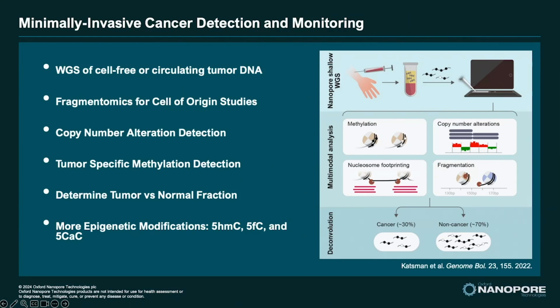And so the final layer of this full multi-omic study that they were conducting was the ability to leverage direct cell-free DNA sequencing for DNA methylation signatures. And this direct sequencing removed the need to use this degrading bisulfite or GC bias-based enzymatic conversion methodologies, and really ensuring that you don't waste a precious and often limited sample that you get from liquid biopsies. And this ultimately makes for more complex and informative sequencing libraries.